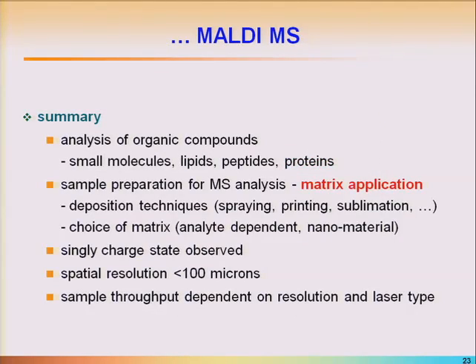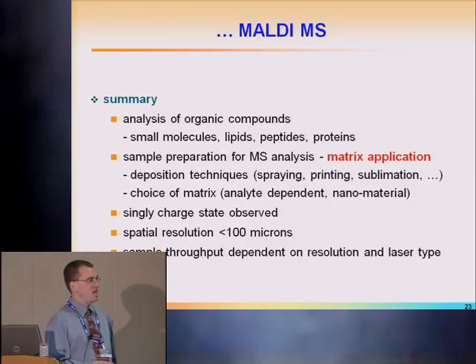So in summary, MALDI is used for the analysis of organic compounds, small molecules, lipids, peptides, and proteins. There is sample preparation for mass spec analysis, the matrix application, and having done it for many, many years, there are still always butterflies in the stomach whether you do it right or not. There are some deposition techniques such as spraying, printing, sublimation, and I'm sure more are coming.